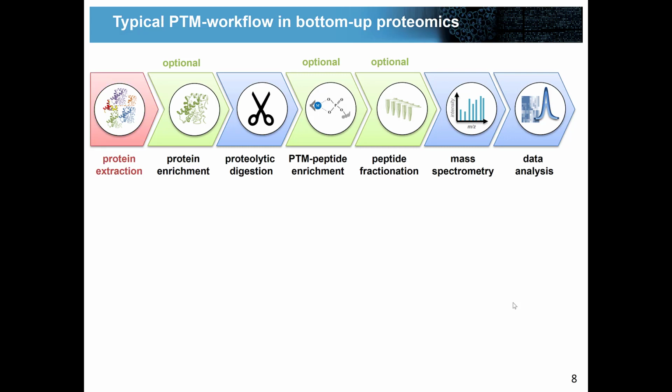So let's get started with the first step, protein extraction. When you start working with some type of sample, it is always, of course, super important that you efficiently and reproducibly extract ideally all proteins from a sample. However, when it comes to PTM analysis, this extraction step is especially important because the PTM status of a protein can change very rapidly during this protein extraction step.